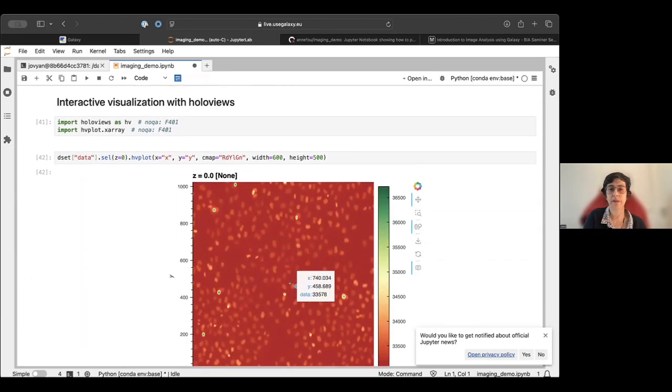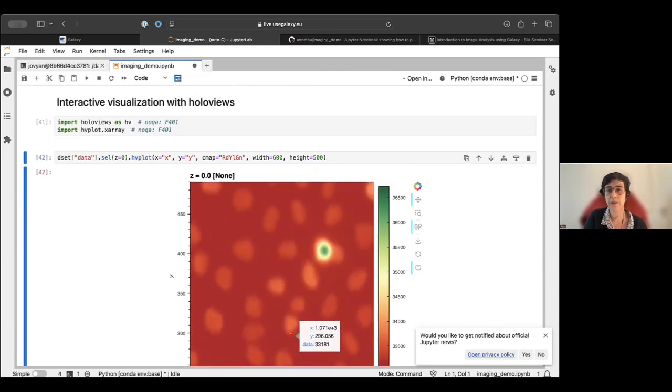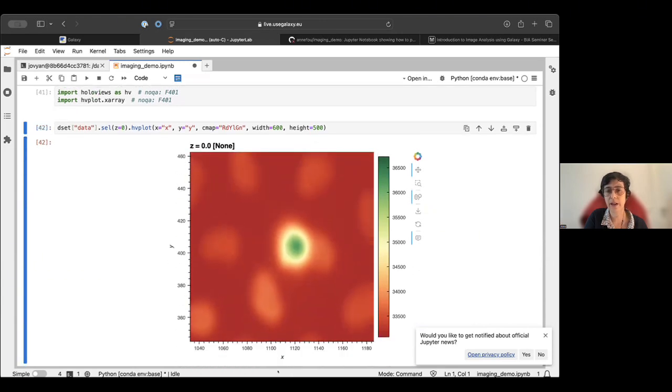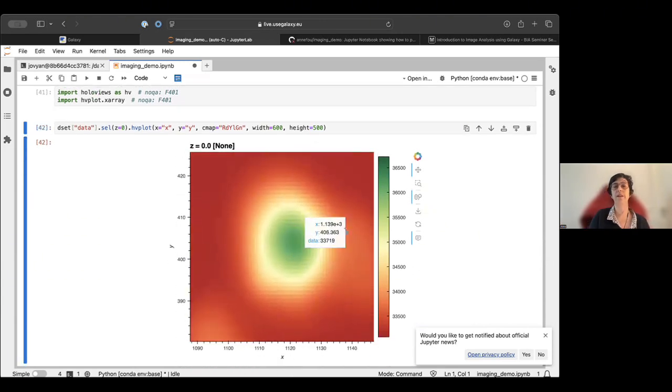So here, for instance, I can see each of the cell values, and I can also zoom in. If I want to interact with a specific area and cell, I could zoom as much as I want, and it makes the process much more interactive.